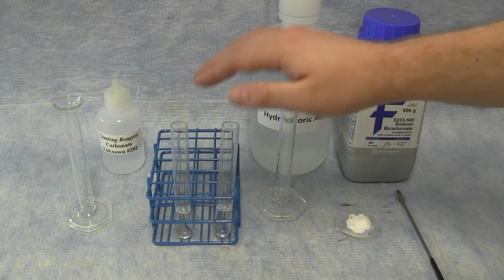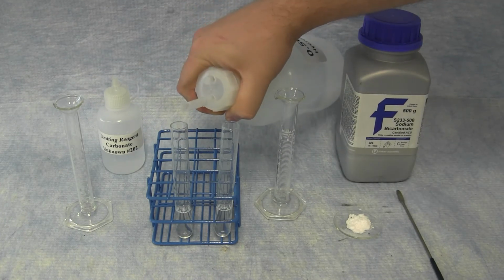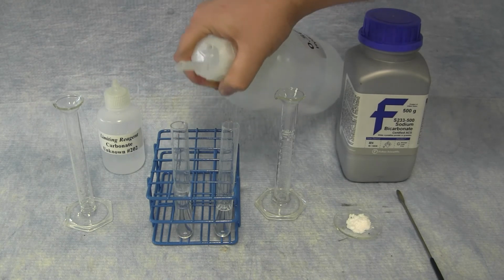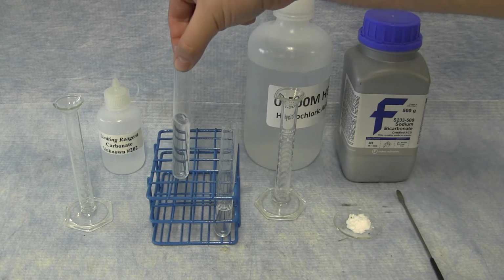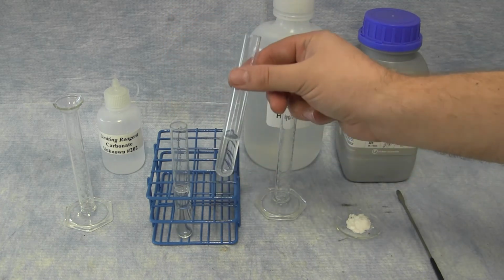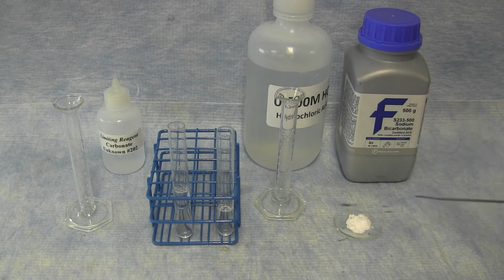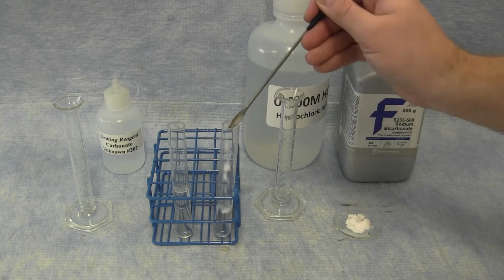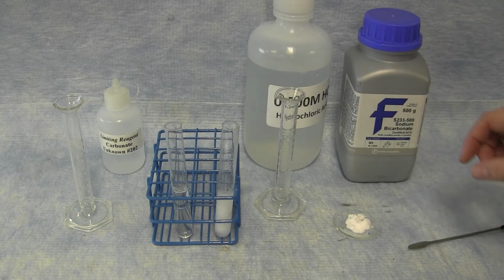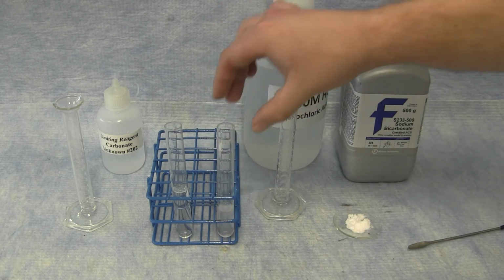To the first test tube, you will add additional hydrochloric acid. You can see from the observations that there was no additional bubbling in this setup. To the second test tube, you will add a small amount of solid sodium bicarbonate or baking soda. And you can see that the reaction continues, in this case rather vigorously.